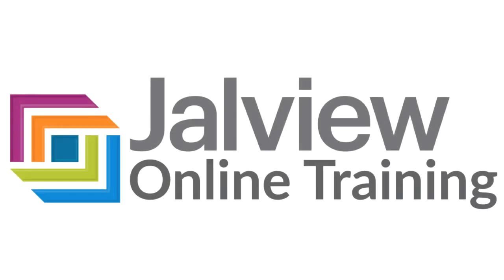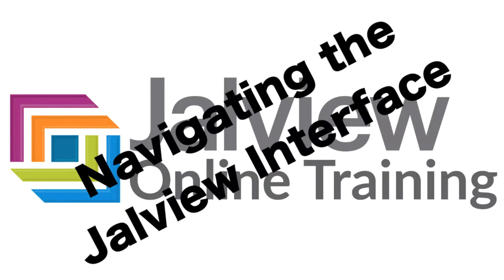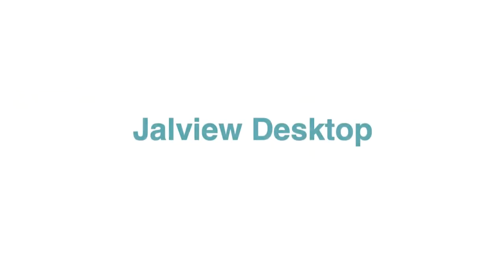Welcome to a Jalview online training video where I will be explaining how to navigate the Jalview interface. Let us look at the Jalview desktop.